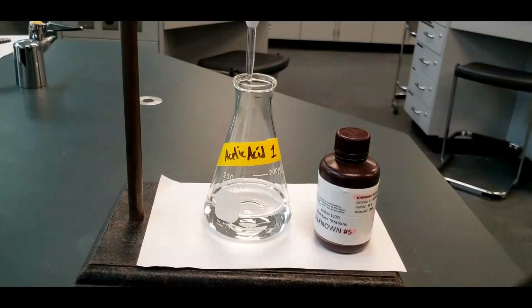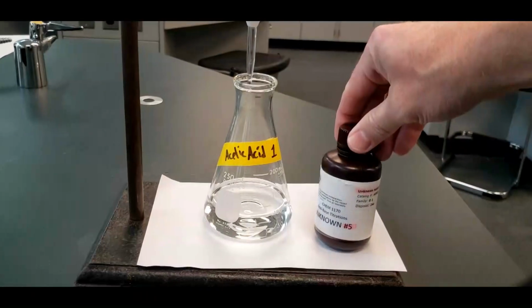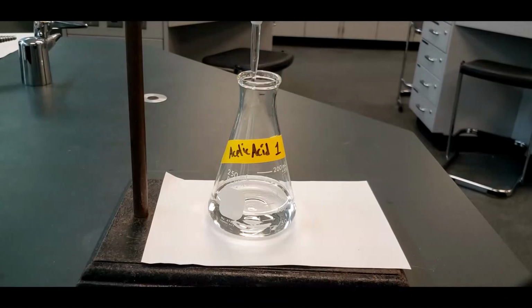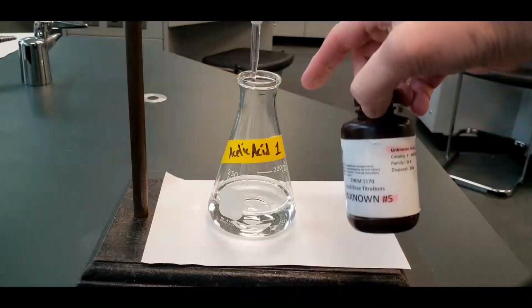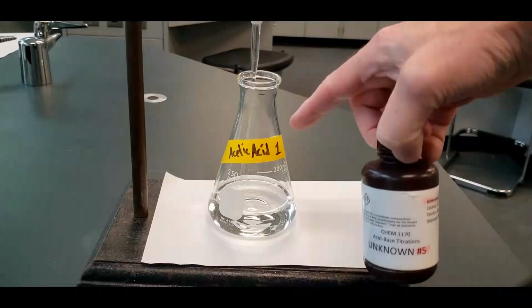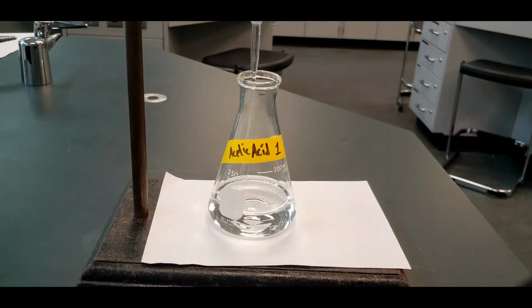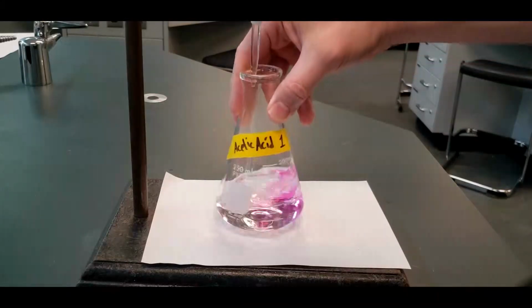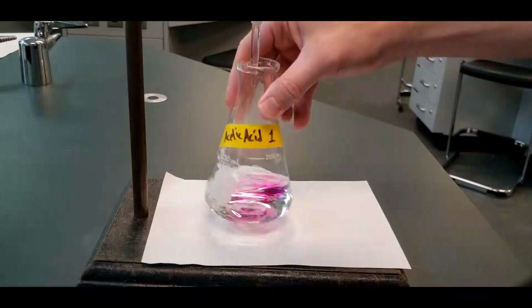Here's the first run of the acetic acid unknown, and I've just left the bottle here. It's unknown 5, but I've already been working on this. I didn't show the preparation because it's the same. You can see this is a liquid, so I just took 10 mils of this, 50 mils of water, and then 5 drops of indicator, just like I did for the HCl. So let's see where we are here. Yeah, you can see already, we're at 14 mils, and it's coming up on the end.